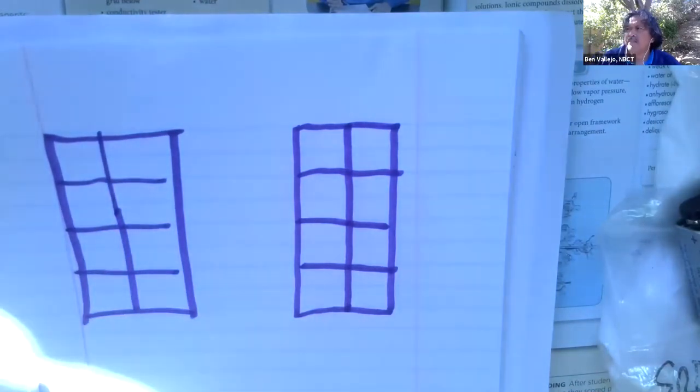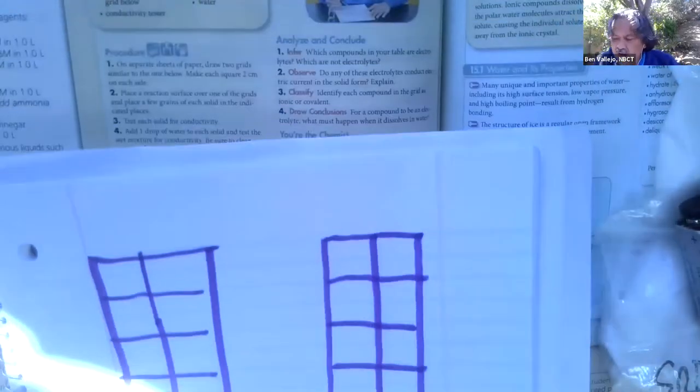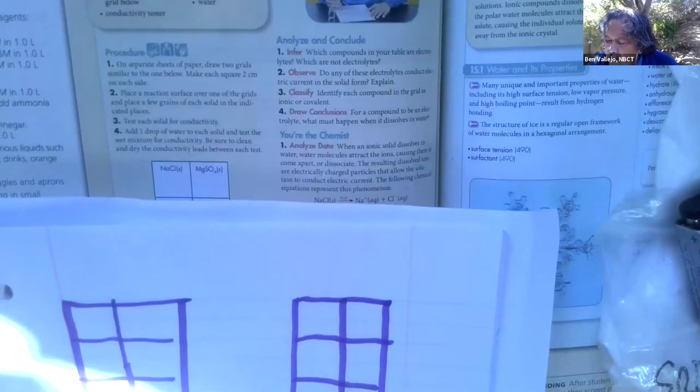All right, so I got two squares, 2 centimeters on each side. It's about 2 centimeters. 2.54 centimeters in an inch. So just short of an inch on either side. Okay, so that's that. Place a reaction surface over one of the grids and place a few grains of each solid in the indicated places.